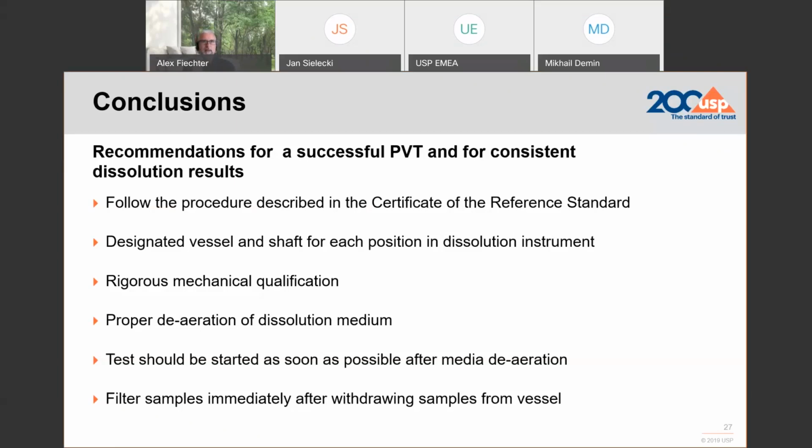This is why filtration of the sample immediately is important. Again, we only take a sample after 30 minutes, where only 40% of the active principle is dissolved. So potentially we might pull undissolved material into the syringe, where it can continue with a certain static dissolution, and results filtered an hour after the sample has been taken may give you different results.